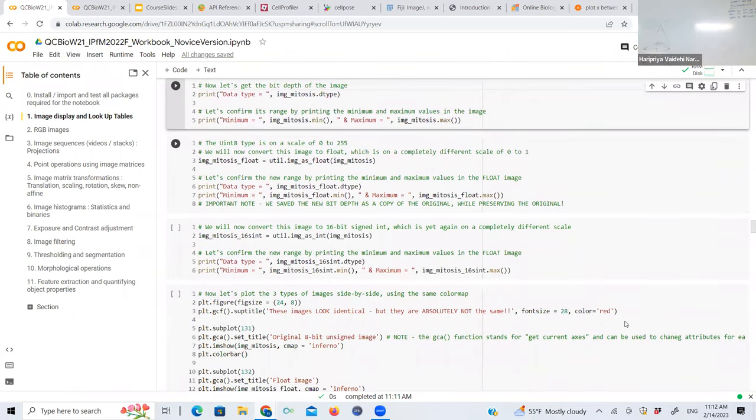I noticed on the contrast you've got the two different colors, the purple and the green. Are those thresholds that you can set, or is this just colors? Yeah, you can actually set thresholds.